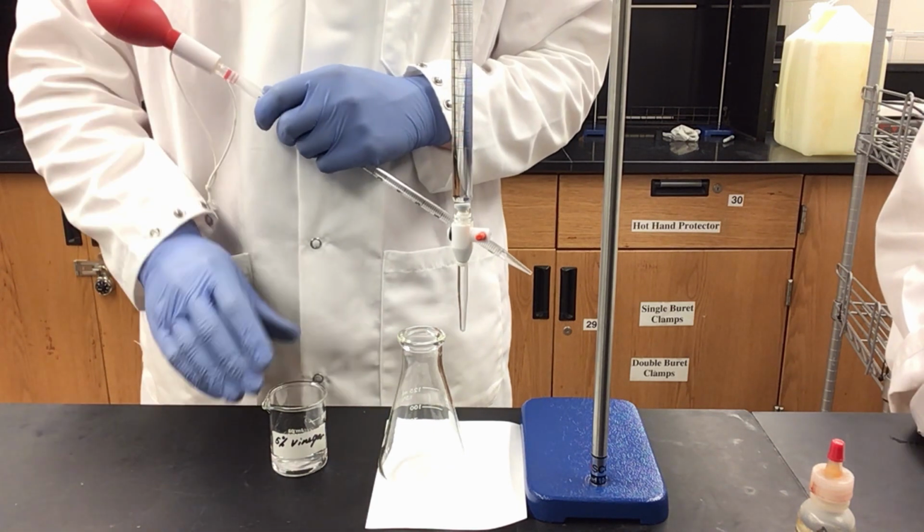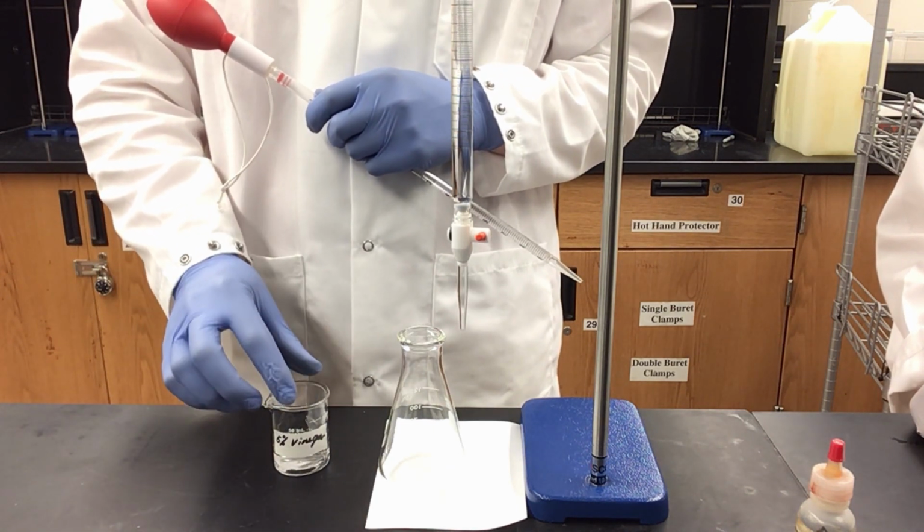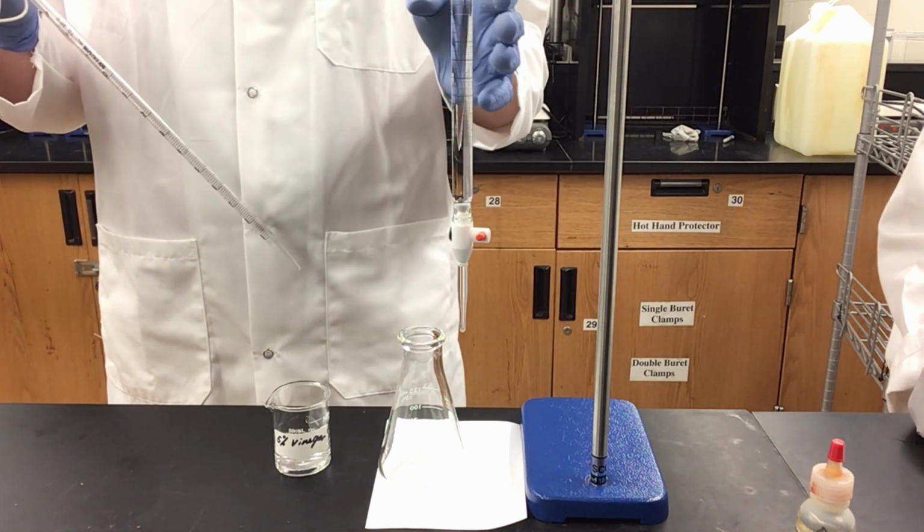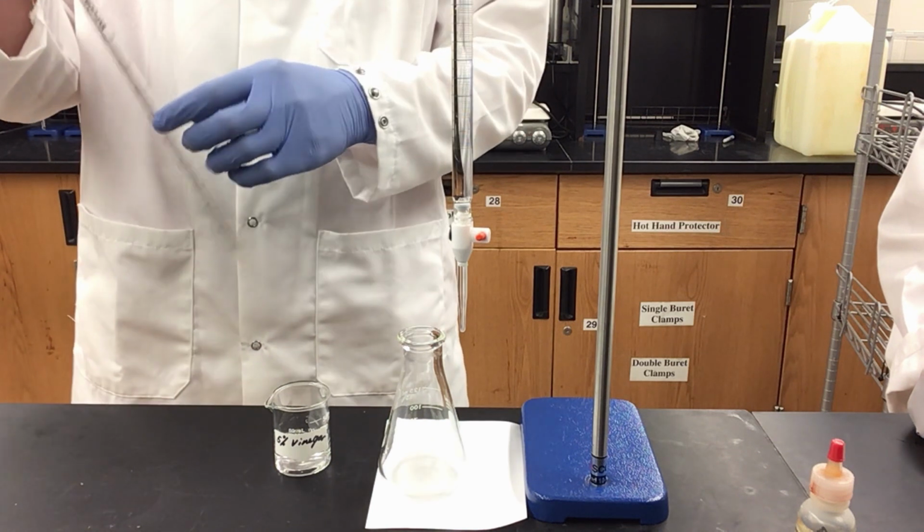We want to use about 40 milliliters of our sodium hydroxide. So through our calculations, we have decided that we need to use about 5 milliliters of our vinegar in order to use about 40 milliliters of our sodium hydroxide.